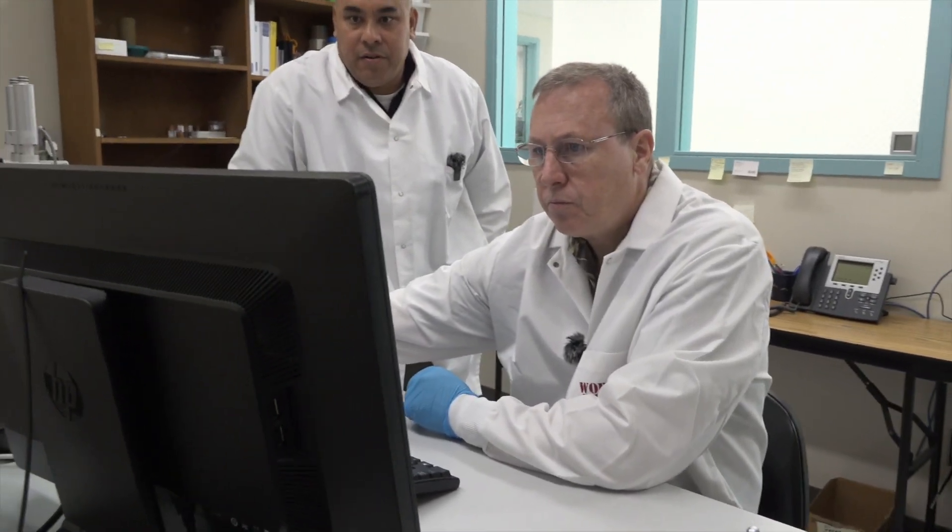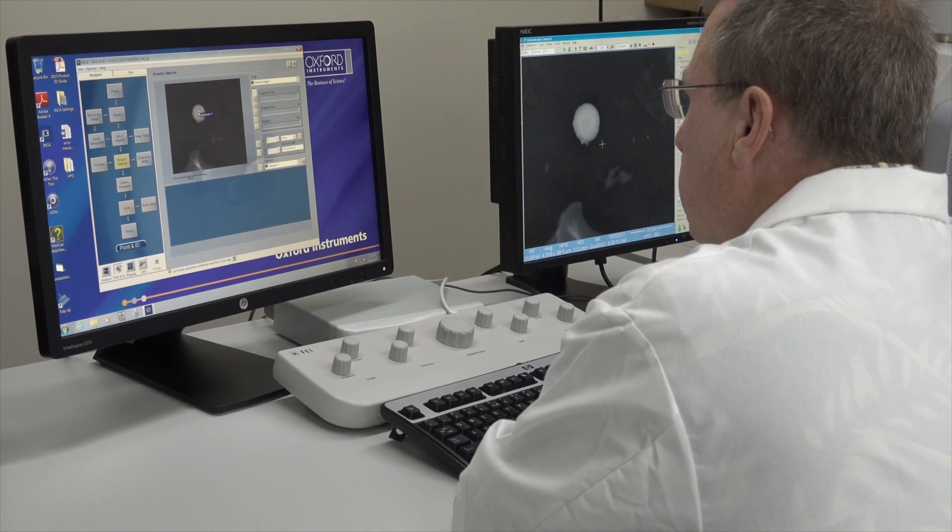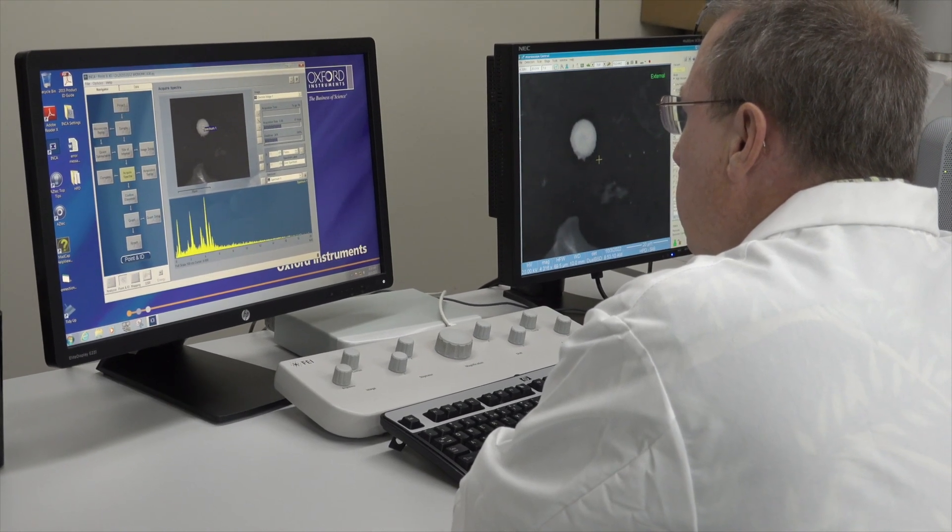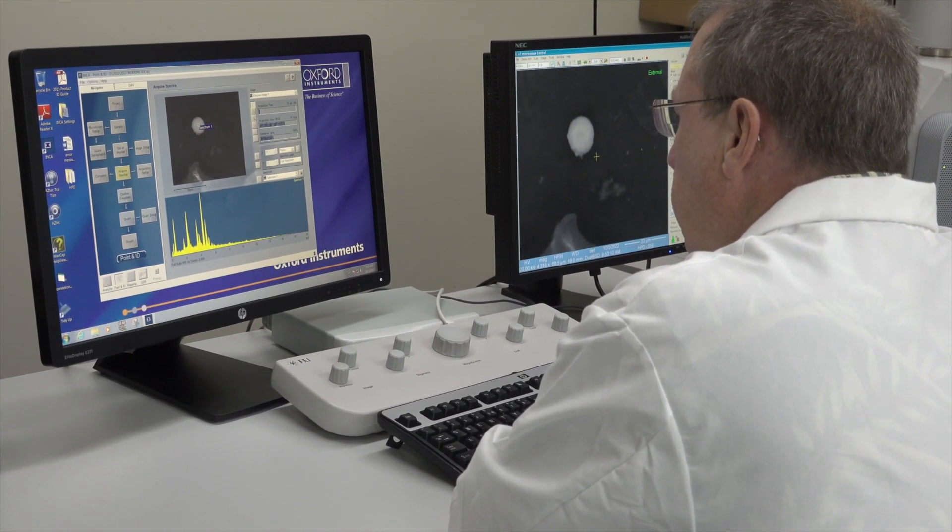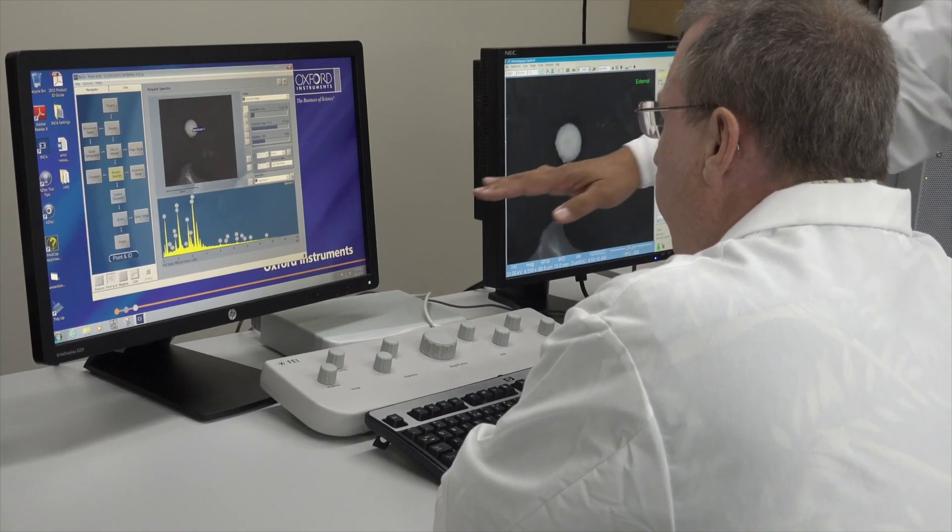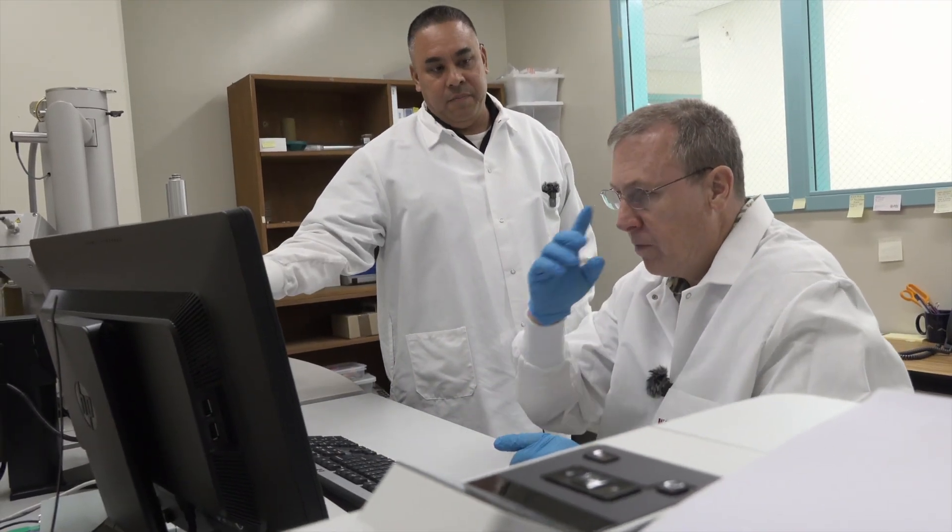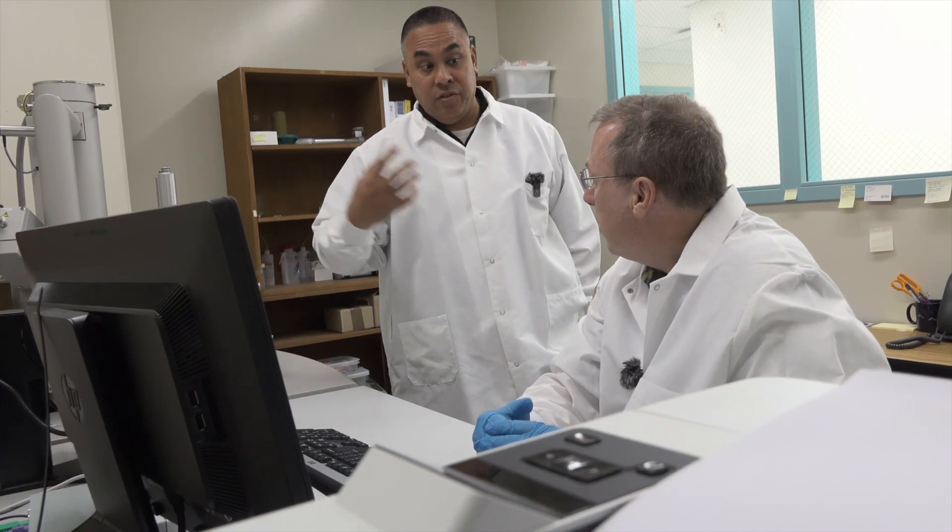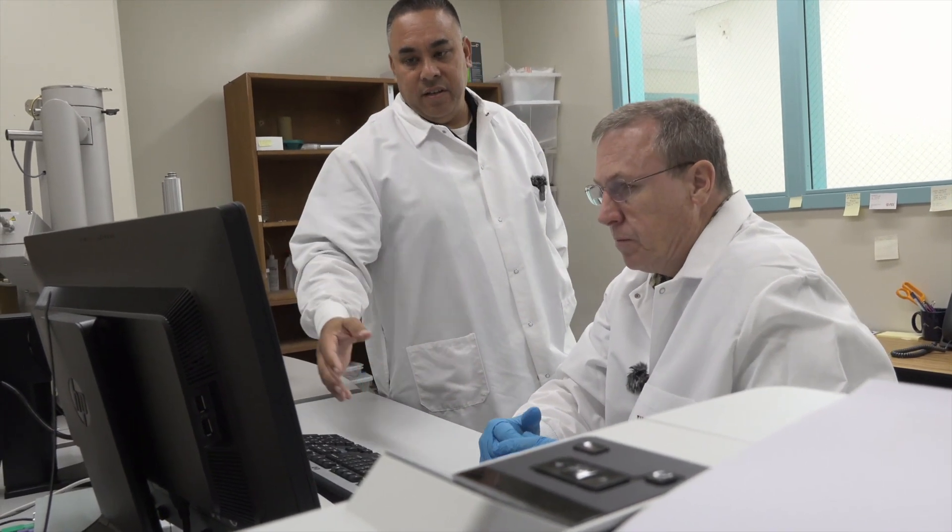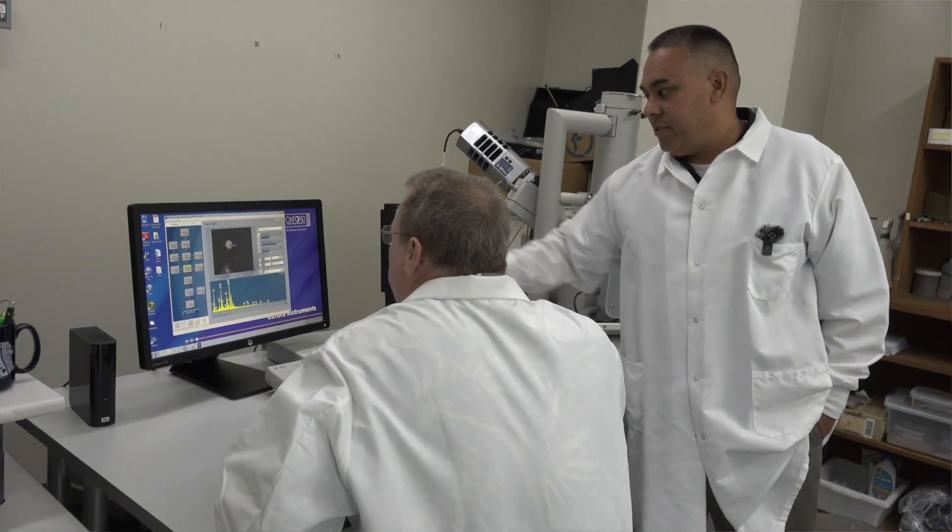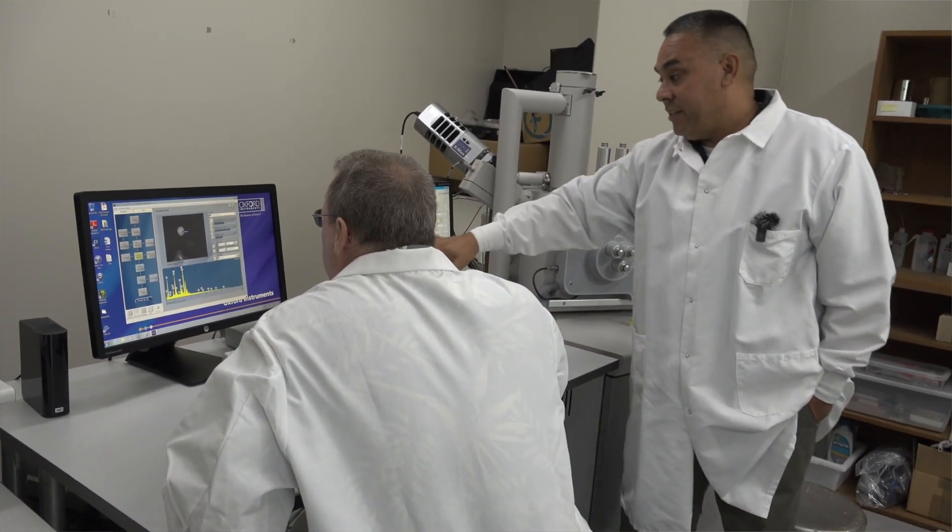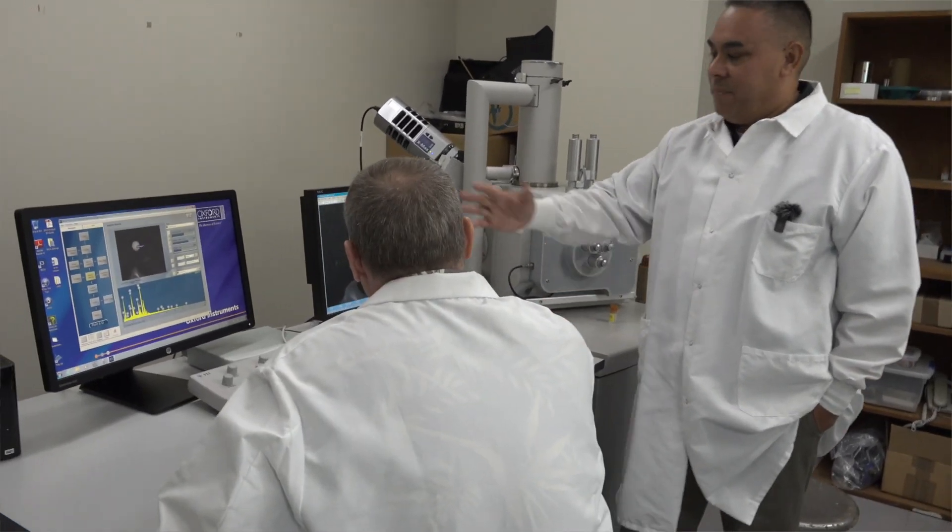So all you want to do is place the cursor right onto that particle right there and just click on it. Now it's going to pull up a spectra of what's in it. These are all energies that are coming off of this particle and every element has its own specific energies. And so lead, barium, and antimony. If this particle contains lead, barium, and antimony, it'll come up in the spectra.